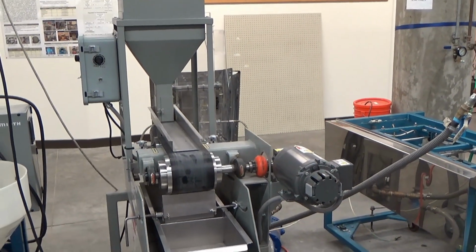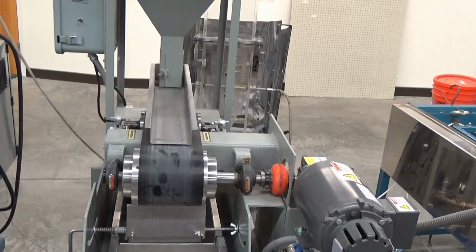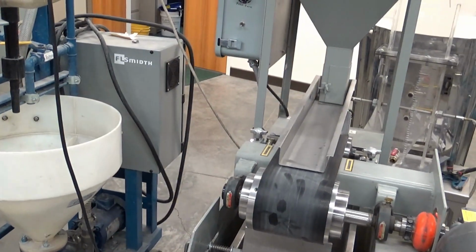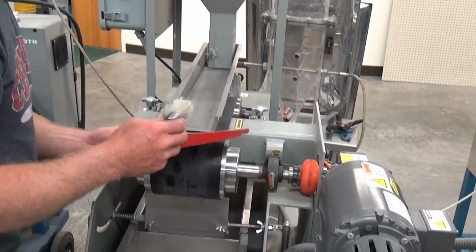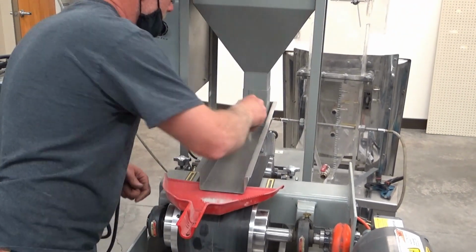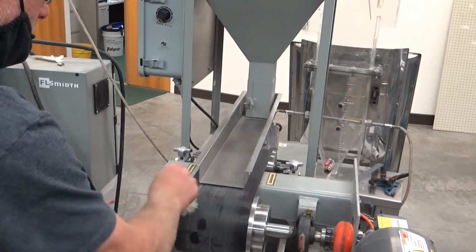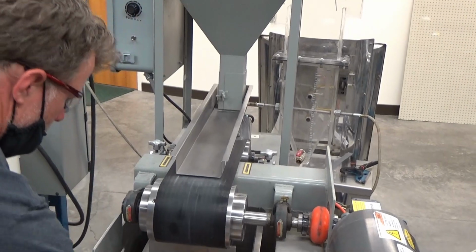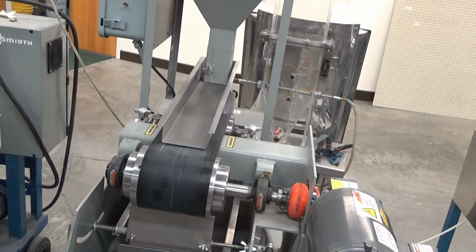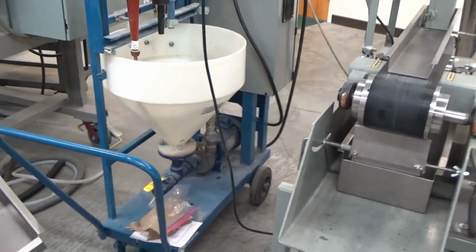So here we are back at camp with Montana B ore, and we're going to try some magnetic separation. I've already taken a head grade. Rick here is getting things cleaned up and ready. Looks like a vibratory feeder to me there. Got to make sure everything's clean so you don't get cross-contamination.